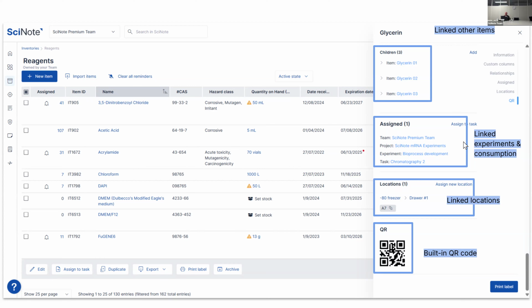But also, so as I mentioned earlier, I think the most important lesson for them was, or based on also their article, that they had one centralized platform for note-taking, documentation, inventory management, SOPs, and traceability. So whenever somebody had to be onboarded, they had to just use this one software and see what's happening in here.